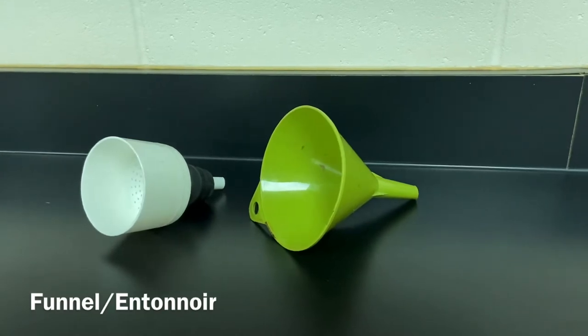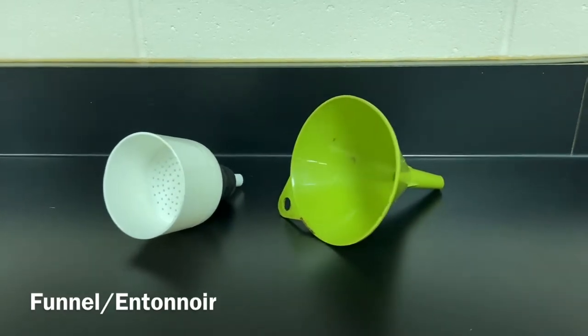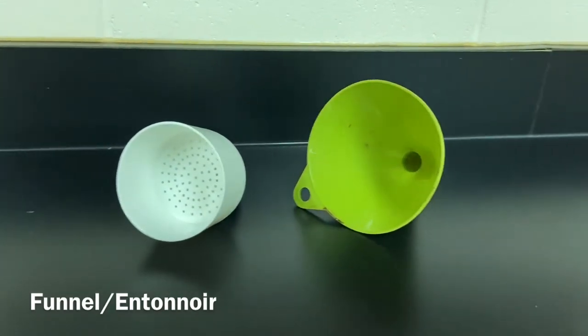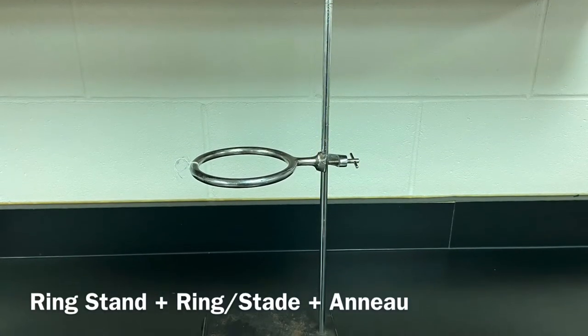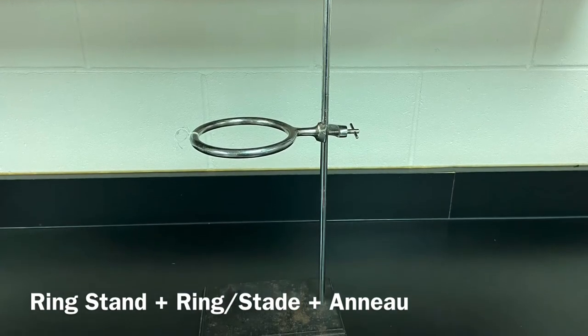Funnel. Entonnoir. Ring stand and ring. Stade et anneau.